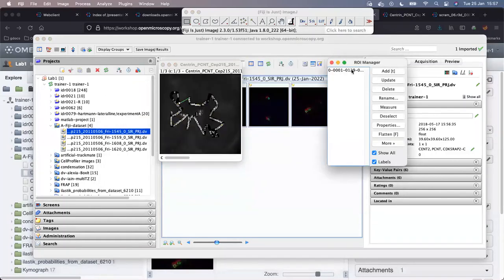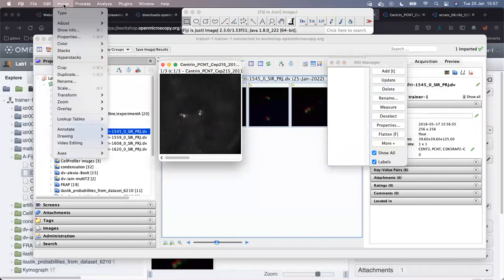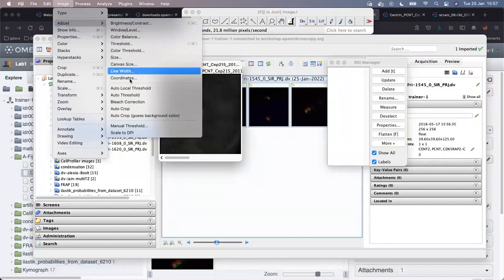Because I had selected a wrong parameter when thresholding, then the follow-up plugin detected the ROI wrongly. It was just a ROI over the whole image.